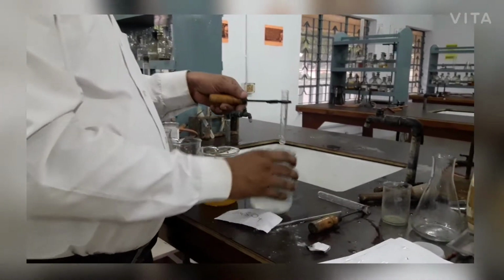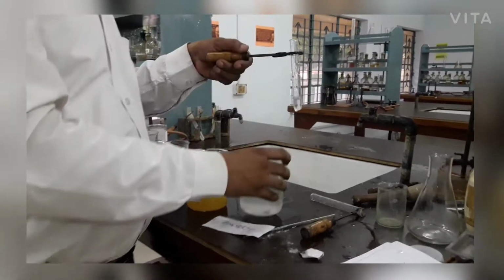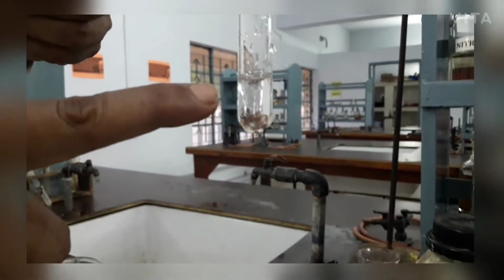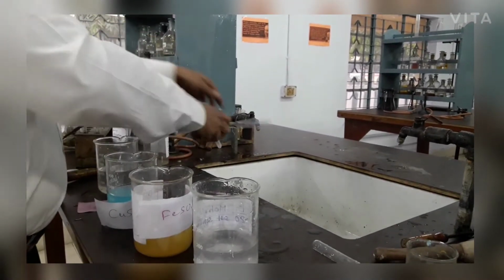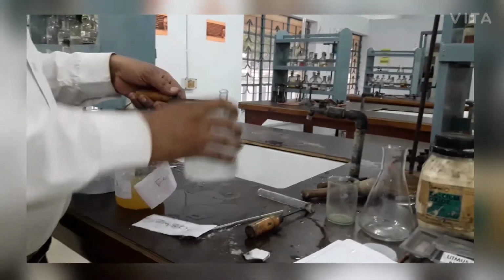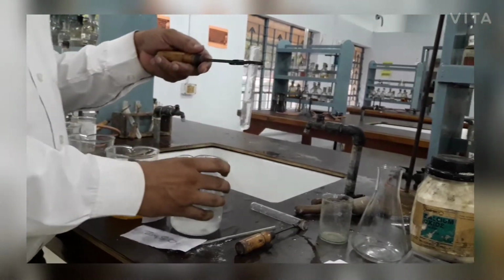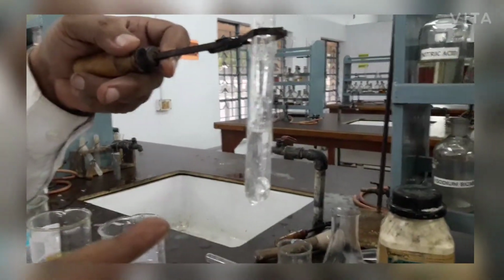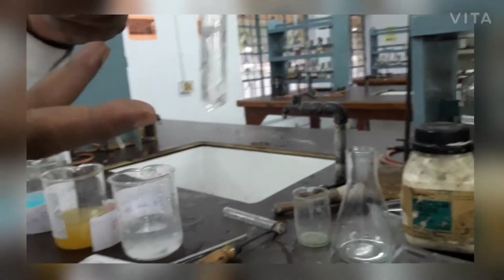Again we are taking zinc sulfate and now we are adding copper turnings. So we observe there is no reaction because copper is less reactive than zinc. Means zinc is more reactive than copper. That's why we have not observed a reaction. And at last, again we are taking zinc sulfate and we are adding zinc metal in it. And we observe, obviously, zinc will not react with zinc sulfate. So no reaction we observe.